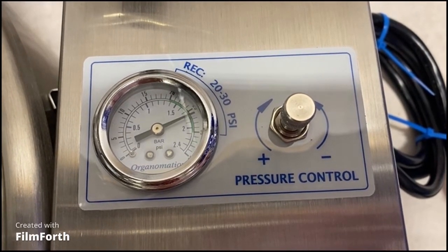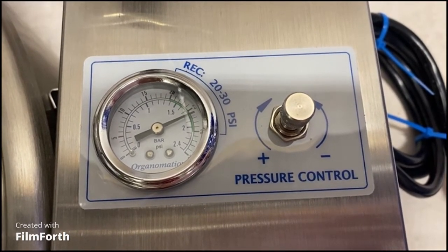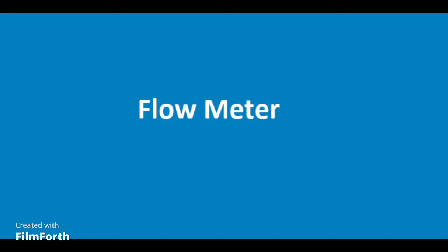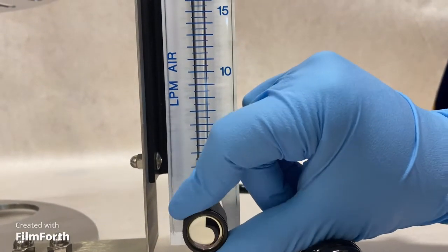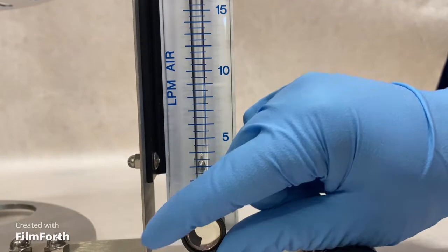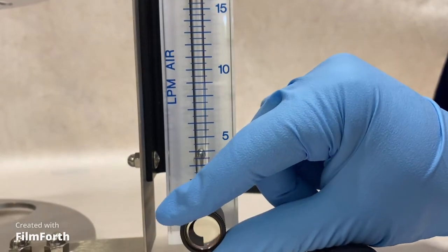If it doesn't respond, the pressure regulator or gauge most likely needs to be replaced. To check the flow meter, turn on the gas switch and rotate the flow meter dial counterclockwise. This should open the valve, causing the ball to respond.